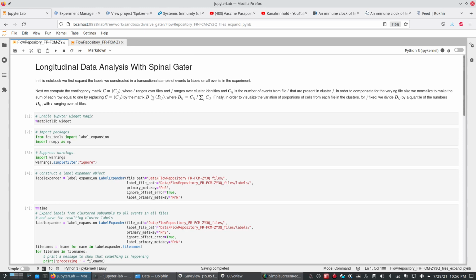So first I compensate for that, and then I say that I want not the colors to be showing what happens across the clusters, only to show what happens across the files. So for each column consisting of files, I make the coloring as uniform or as nice as I can.